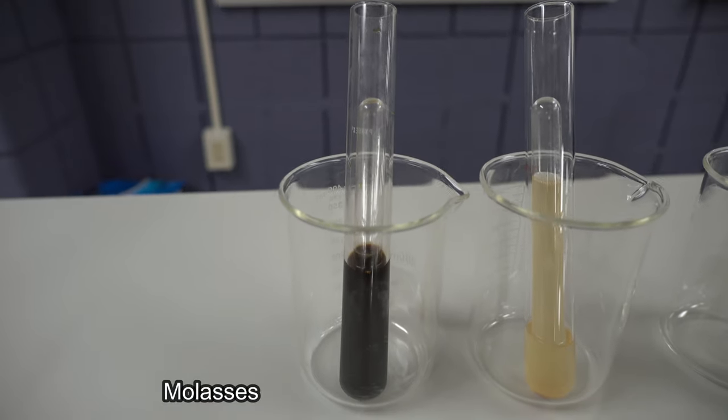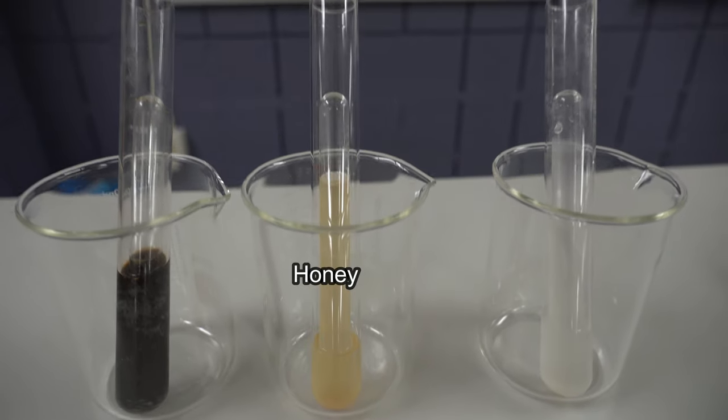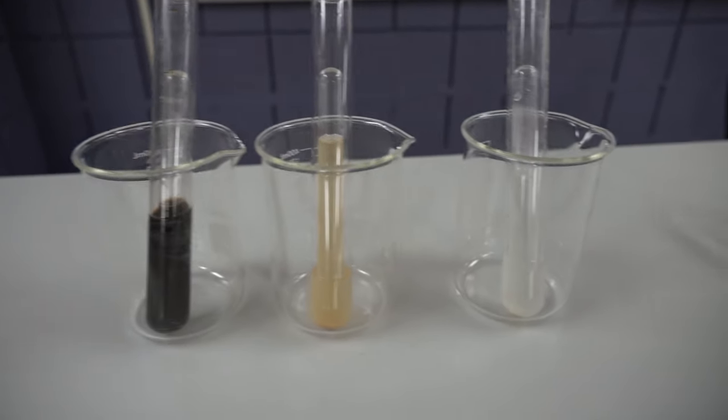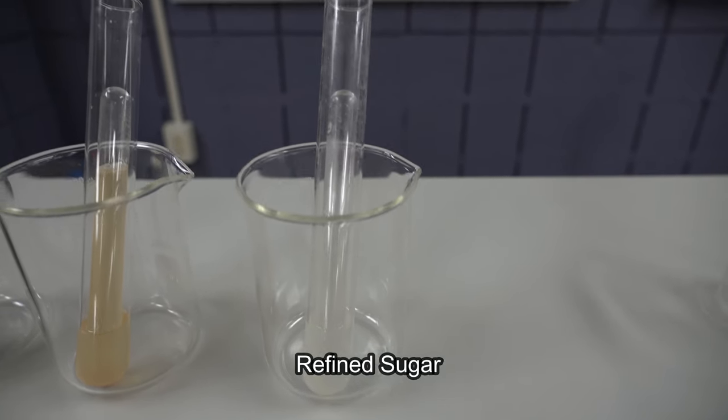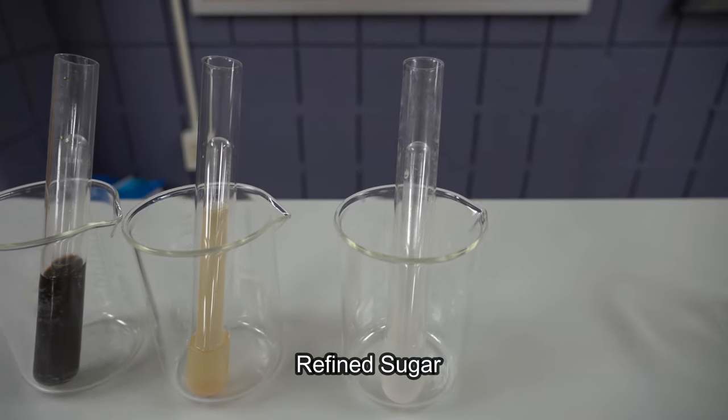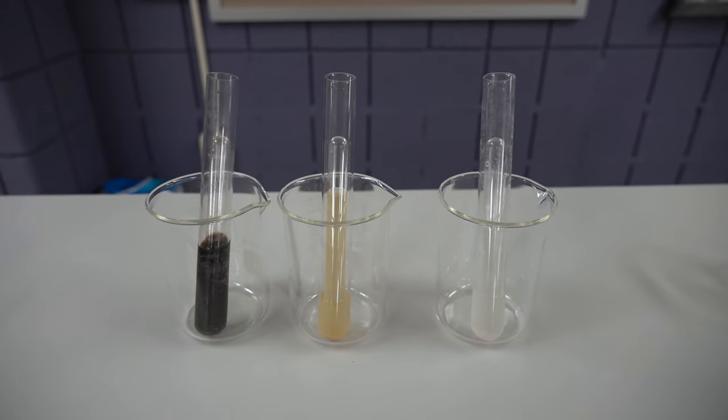And here we can clearly see those differences. This is, again, the molasses producing the most. In comparison, the honey here has the least amount, and the refined sugar is clear, liquid solution is a little harder to see, but that had the second most. So again, we're looking here, we're directly correlating carbon dioxide production to the yeast population.